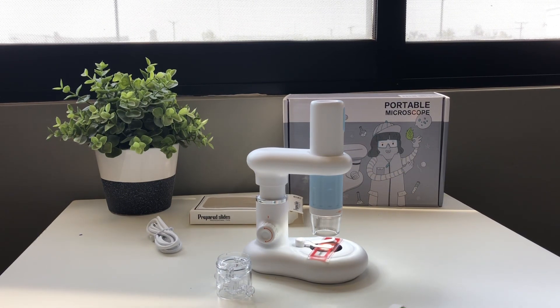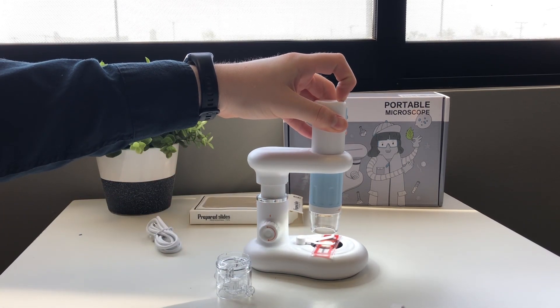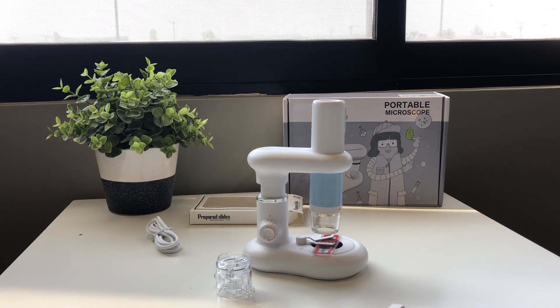As you can see, it's a very fun microscope. You can gift it to kids that are interested in science. I really recommend it — it's very easy to use and very practical. The connection to your cell phone is extremely easy and it works just well. I like it very much. I like that it's very portable; you can take it almost anywhere. It's really convenient. It's a great, great buy. Bye!